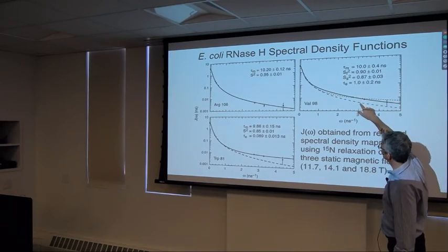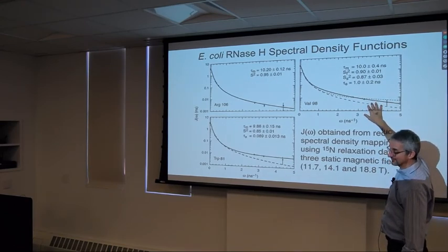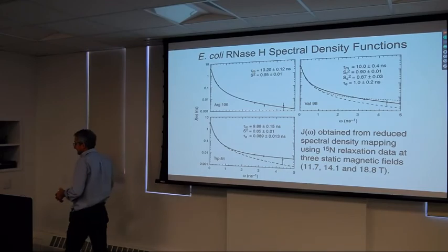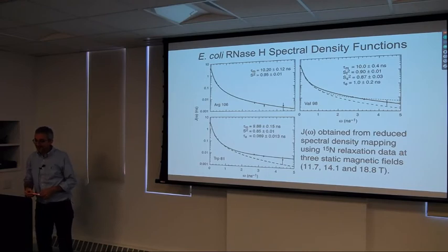So distinguishing the models depends very much on the hydrogen Larmor spectral densities. And if one looks back at the analyses, that ends up depending a great deal on the NOE experiment. Remember, the NOE experiment is the least sensitive experiment because it starts with natural nitrogen magnetization.